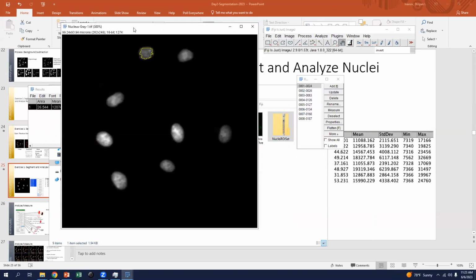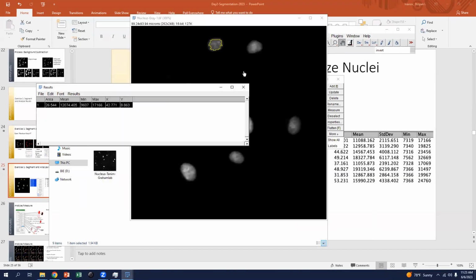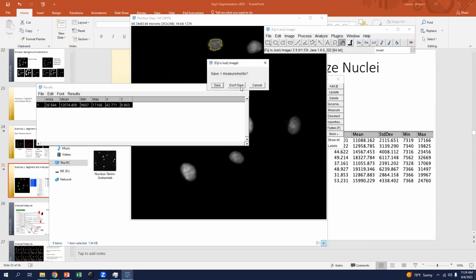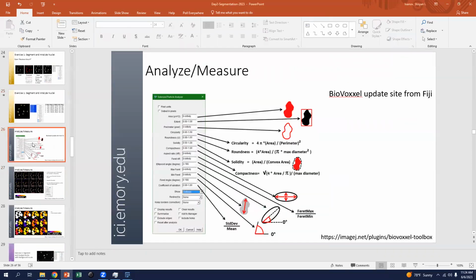So this is one of the biggest utilities of creating a mask with a thresholding method, because we can then go from just knowing where the different structures are to actually characterizing them based on our data. And the mask we can then feed into other programs if we needed to. So it's very powerful. And once we have it done, we can do a lot with it. So I will show you some of that.